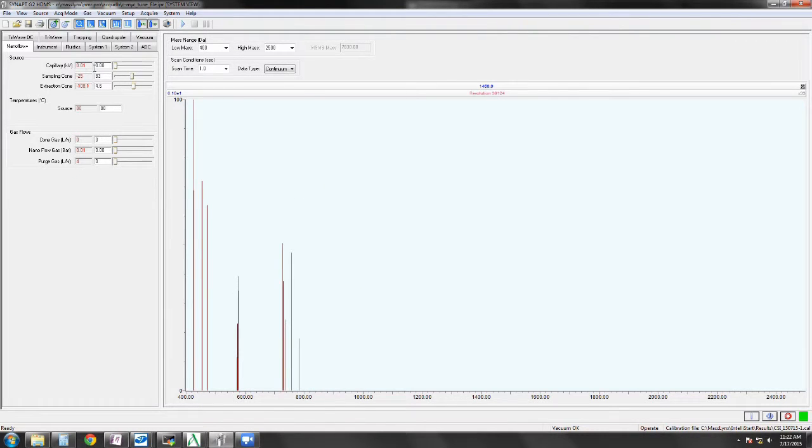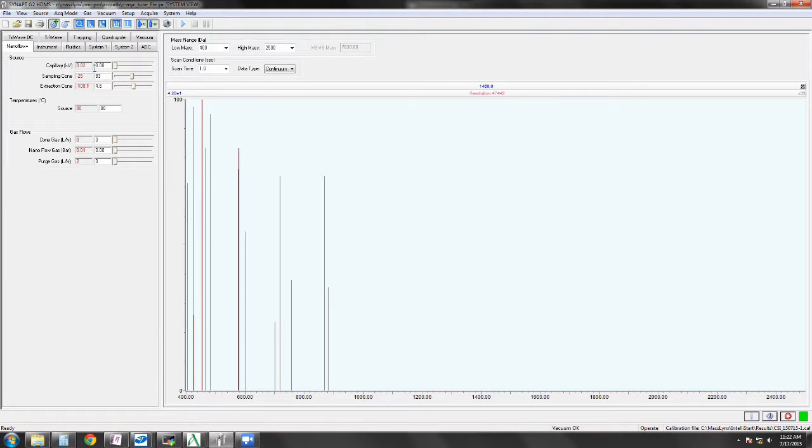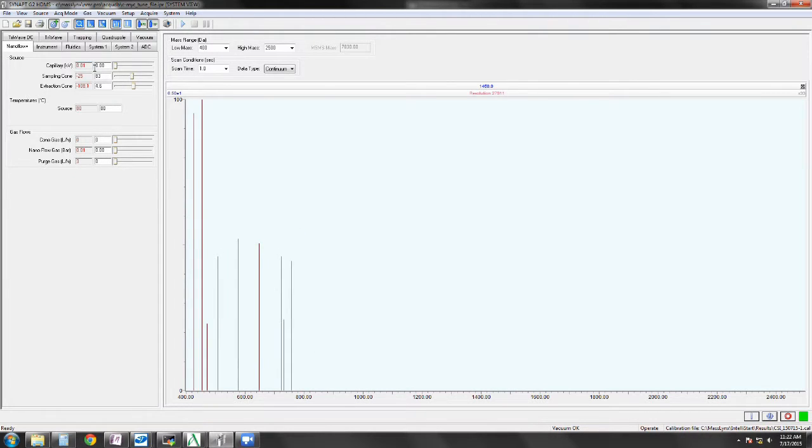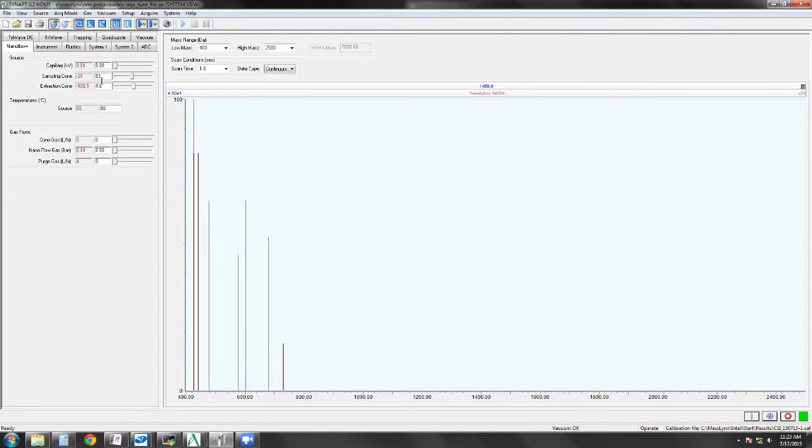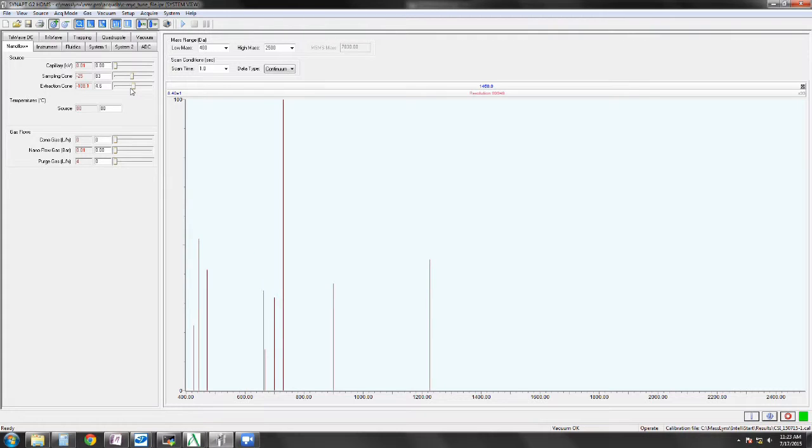The first is the capillary voltage. This is the voltage you are applying to the tip. For nano electrospray, you want it between 1 and 1.8, the highest 2 kilovolts. Although you want to keep this as low as possible. If you're doing ESI, you can go higher between 2.5 and 3. If you're doing LC flow rates, you'll probably want a higher capillary to ensure you get spray throughout. The next setting is the sampling cone or cone. This is how strongly ions are pulled into the source. A low cone setting will keep intact non-covalent complexes. A higher cone setting will knock off salt, which is very important for doing larger systems. In general, try and keep it as low as possible to keep your samples in the most native fashion.